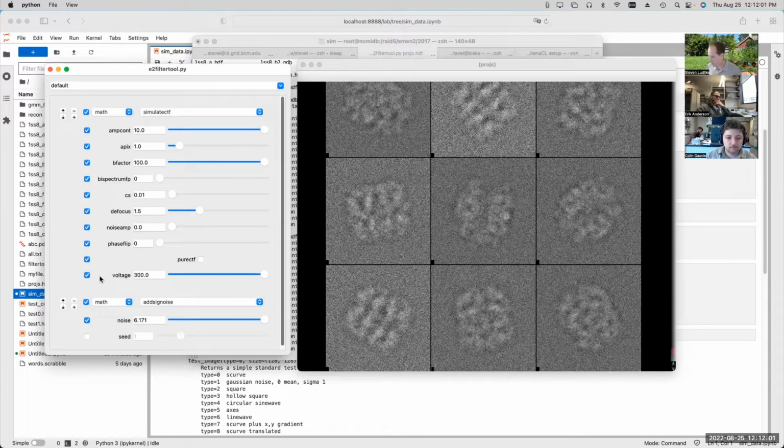So all those sources of noise are pretty fundamental, and they're not quite flat band. The noise that we're adding here is so-called flat band noise. If you look at the Fourier transform of the noise, it's going to be flat, with a constant Fourier transform intensity.